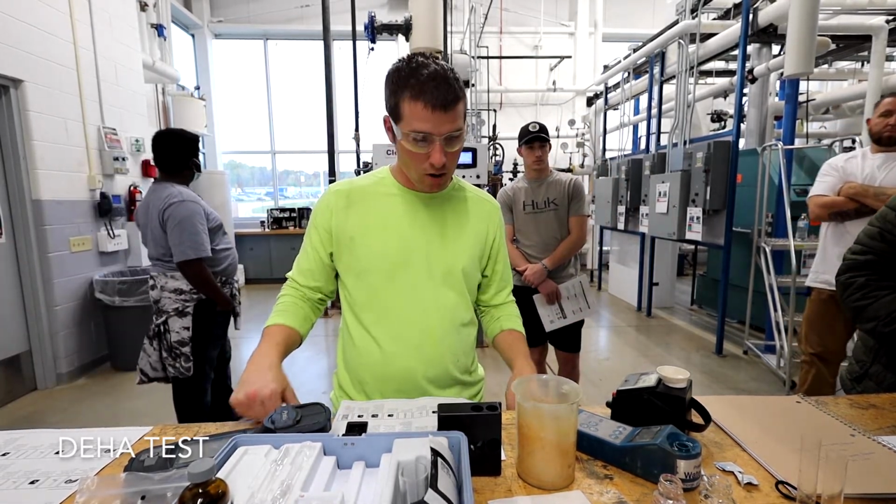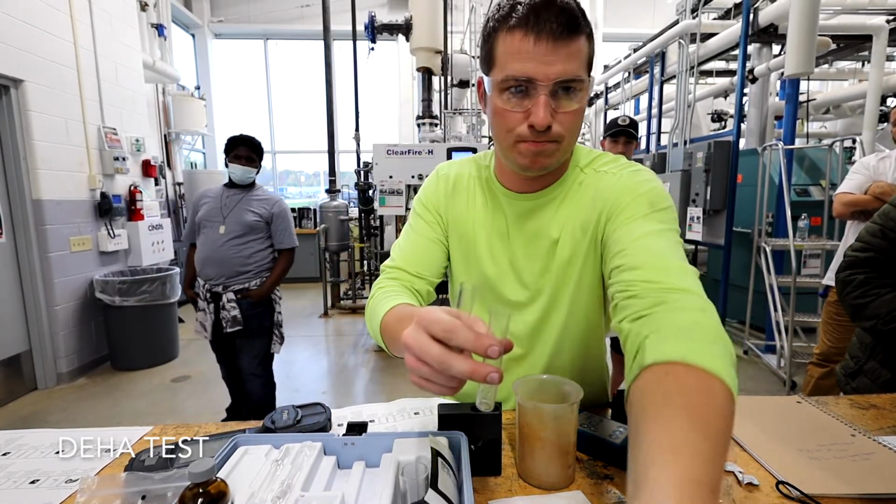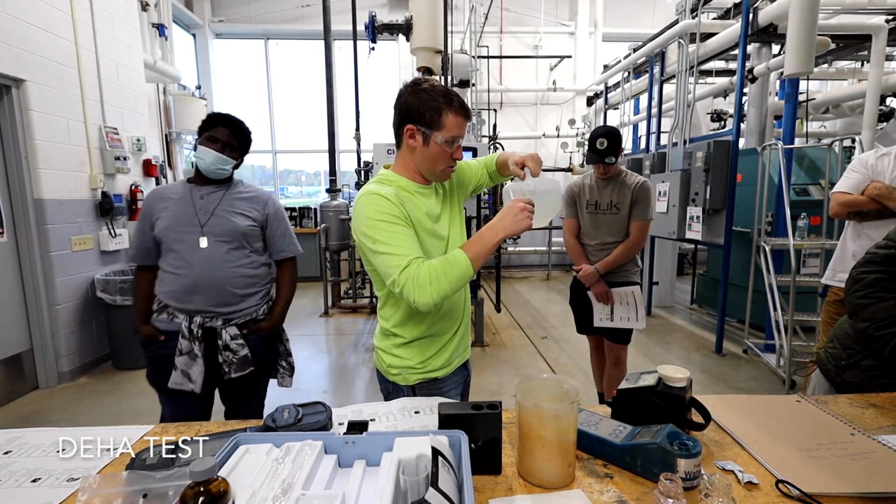All right, so let's fill these up now. I'm going to rinse this one more time because we have some purple still hanging out in that one. I don't want it to skew our results.